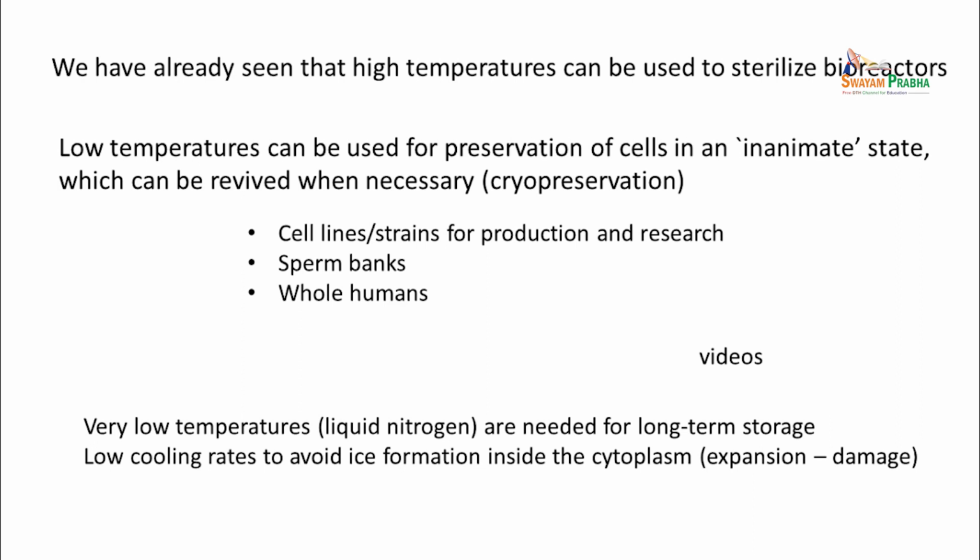So that is a real danger, and therefore the rate of cooling needs to be kept in mind, and set procedures used and some other methods used to prevent ice damage when cooling is done.